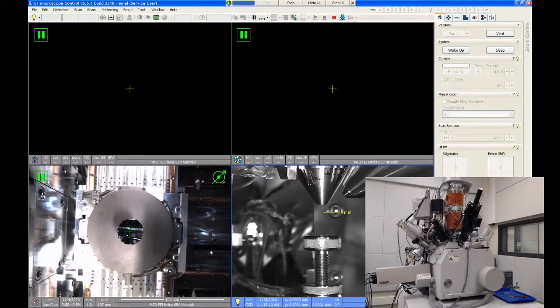Main components are real similar to any SEM you're gonna find. In the center here is the main vacuum chamber. This is what holds the stage. This is where your sample goes. The stage in this microscope can accommodate a 6-inch diameter silicon wafer. So it's a rather large internal volume in that chamber, but certainly you can put in smaller samples.